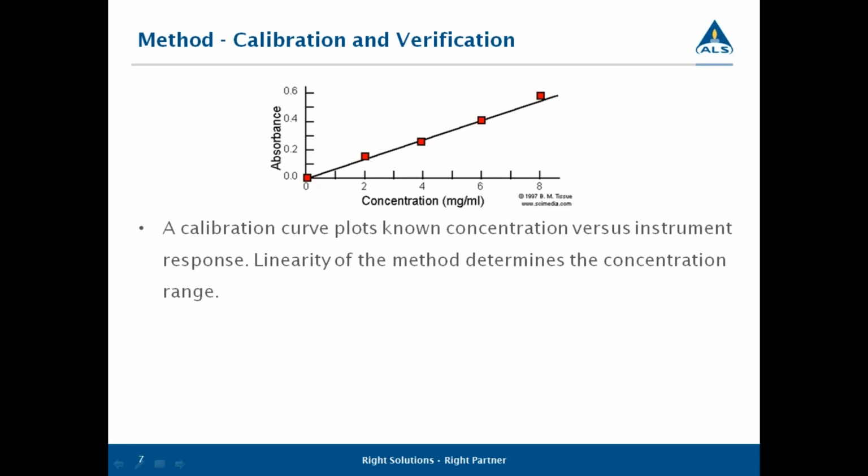Our goal is not only to have a linear range to compare sample results to, but we also want to make sure that we're analyzing your samples in such a way, either straight or at dilution if need be, so that the resulting concentration is somewhere within that linear range, if there's a detection, obviously, between the low standard and the high standard.